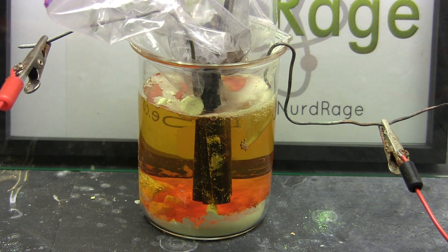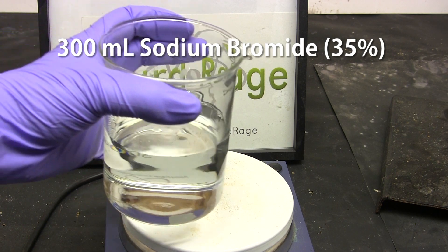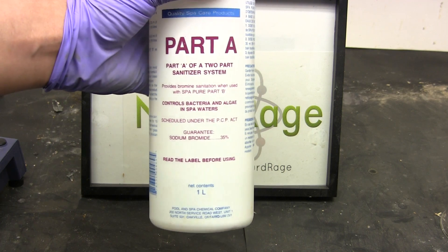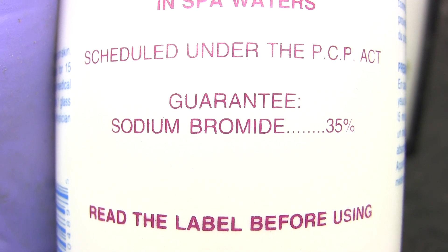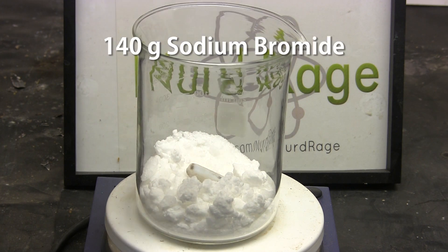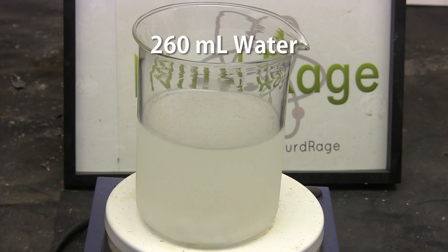We start with 300mL of a 35% solution of sodium bromide, available as a chemical for swimming pools. The reason I'm using this particular percentage is because all of my local stores sell it pre-mixed as a 35% solution. If you have solid sodium bromide, just mix 140g of it with 260mL of water to match the solution I'm using here.